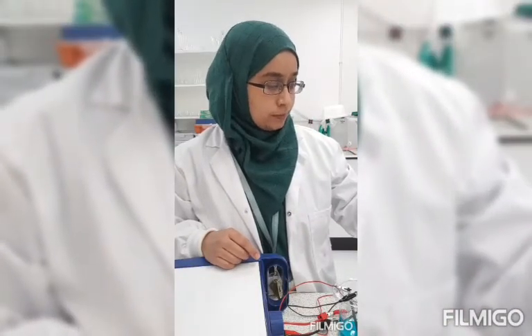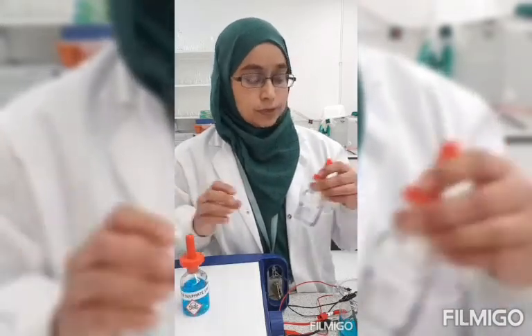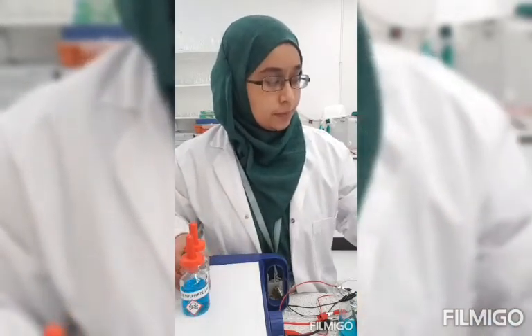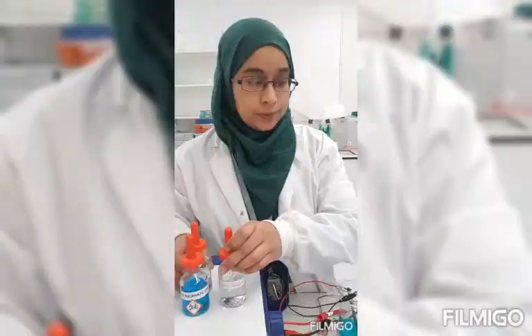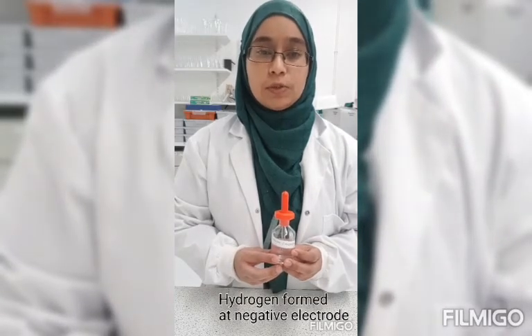You can repeat the practical using the other solutions, such as copper sulfate, sodium chloride, and sodium sulfate. If I was to use sodium chloride, then again on the positive electrode I would get some chlorine being formed, and on the negative electrode I would get hydrogen being formed. This is because sodium is more reactive than hydrogen, and therefore hydrogen is discharged at the electrode.